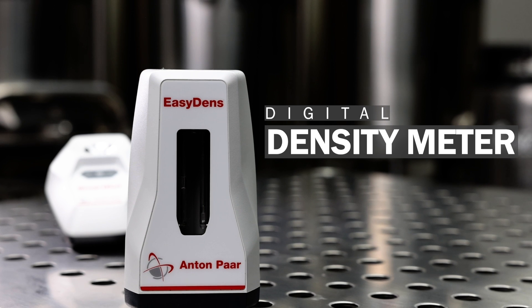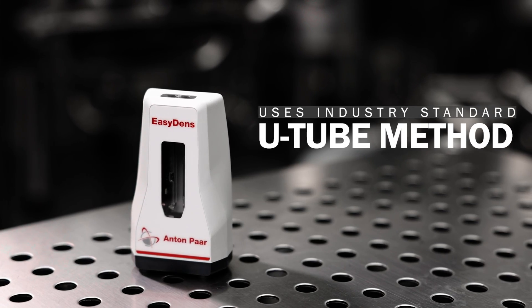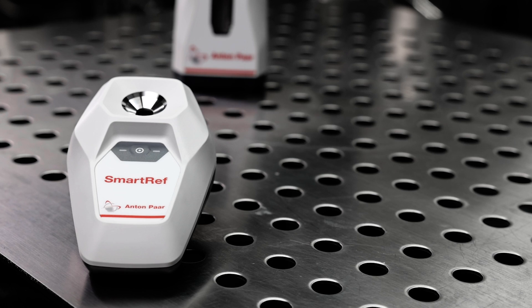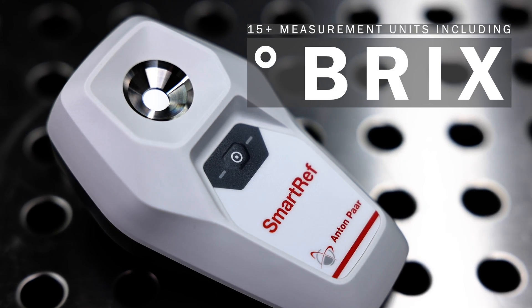The EasyDens provides highly accurate measurement results throughout the beer production process, ideal for passionate home and craft brewers looking to optimize the brewing process. In contrast, the SmartRef is a digital refractometer that measures the refractive index of liquids, and that helps determine measurement parameters such as Brix.